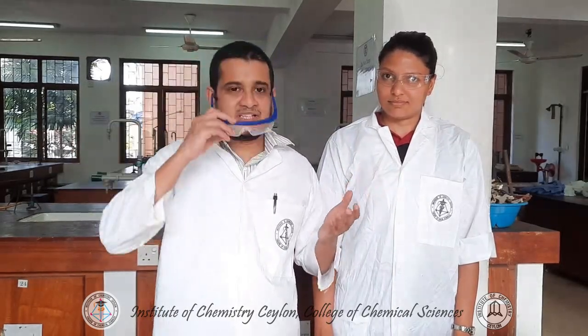And one common mistake students make is wearing the eyewear not over the eyes. They wear the eyewear like this, or sometimes like this, or sometimes like this. You have to prevent that from happening, and you have to wear your safety eyewear properly.